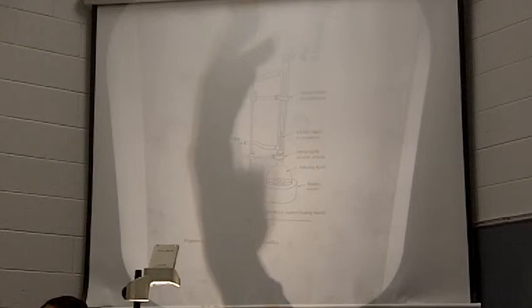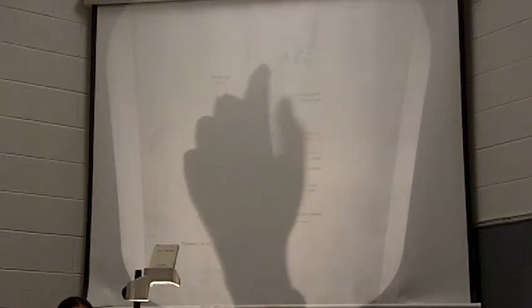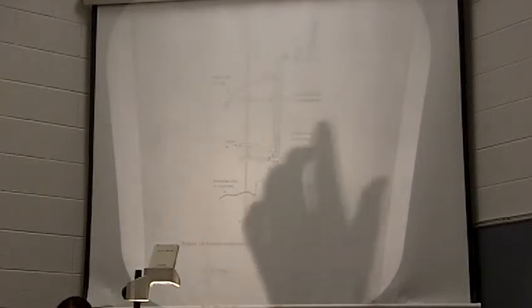The other thing that's really important is the top of our condenser is open. There is nothing on top of it, okay? You do not want to seal off the top of your condenser, because then you're heating a closed system, all right? And heating a closed system is bad because eventually we're going to build up enough pressure that we need to release something, and so something will fly out of the system, okay? So no stoppers on top of reflux condensers, all right? We don't want a closed system. So you guys are going to set up your reflux apparatus, and then we're going to go around and check them before you start heating, all right?